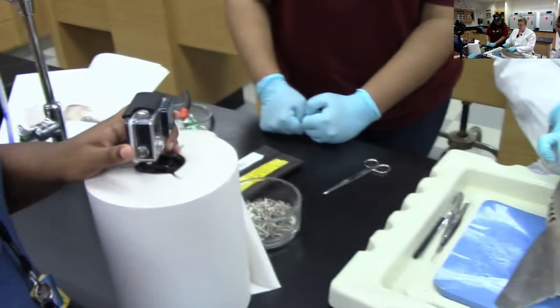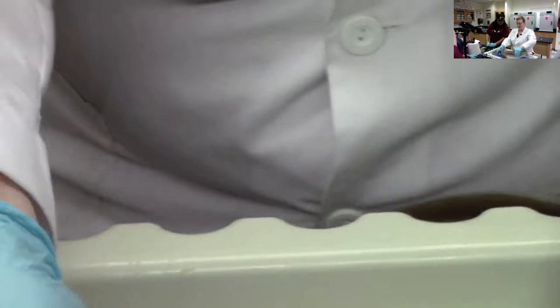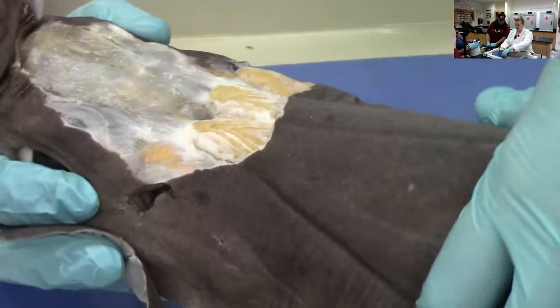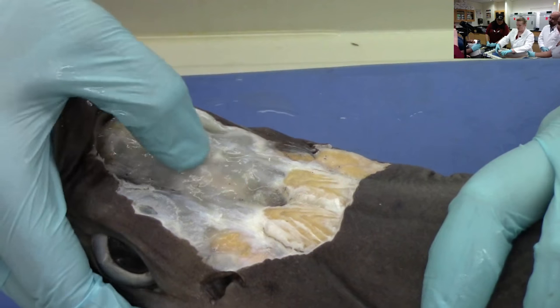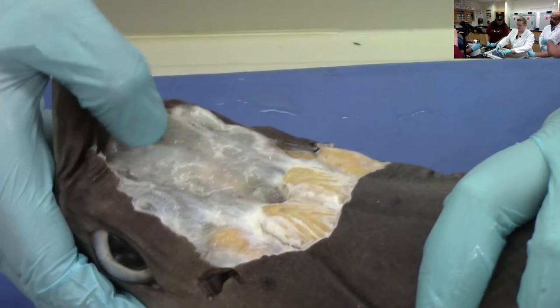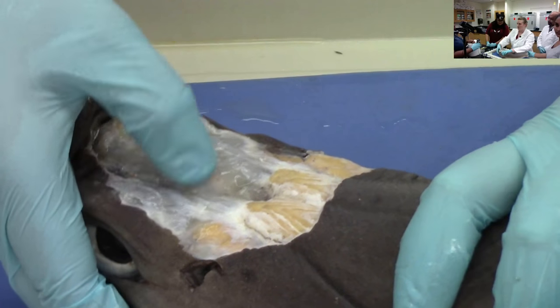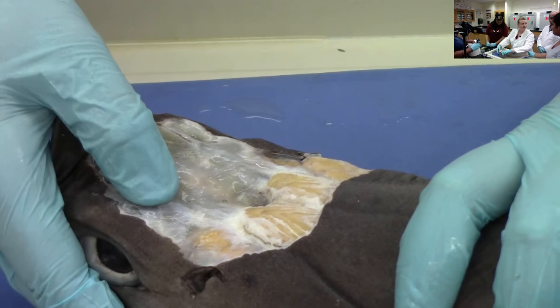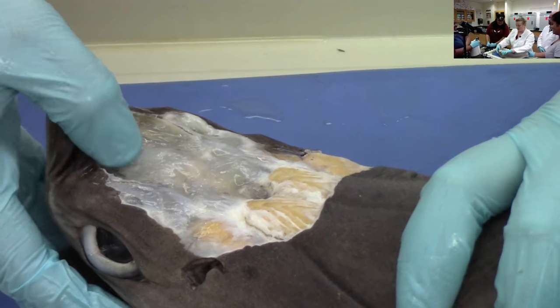So while we were waiting, we took off the skin on the head, so we'll do this before we take her apart. You can see sharks are made of cartilage, so all of their skeleton — she's hitting me with her tail — all of the skeleton's made of cartilage. So this is her skull, and in sharks this is called the chondrocranium. Do you know what the prefix chondro means? Cartilage. Yeah, so it literally means cranium made of cartilage.